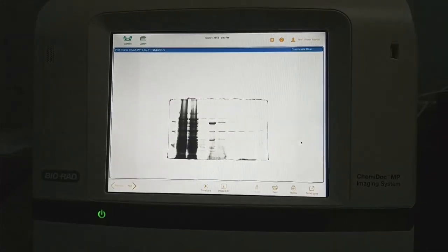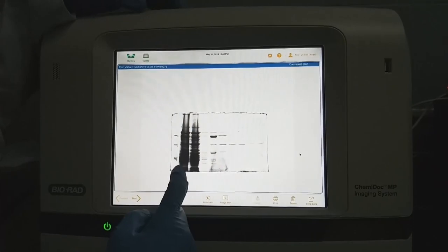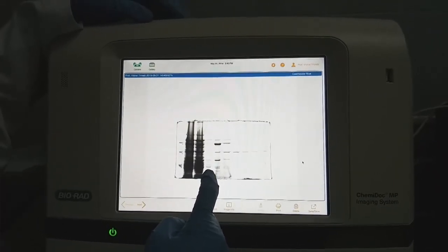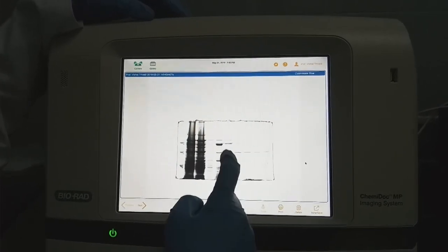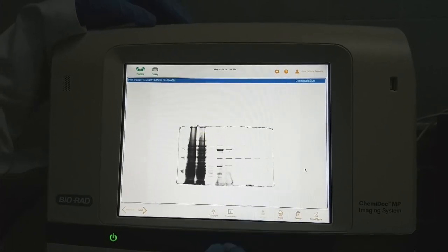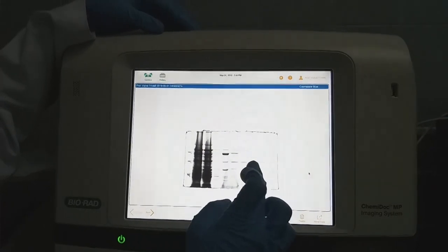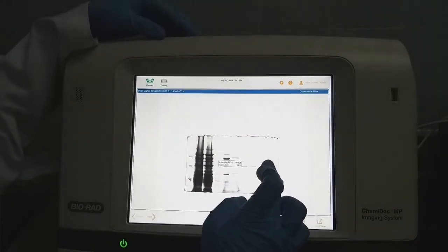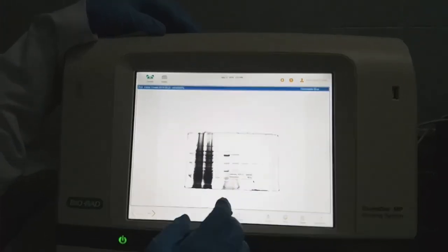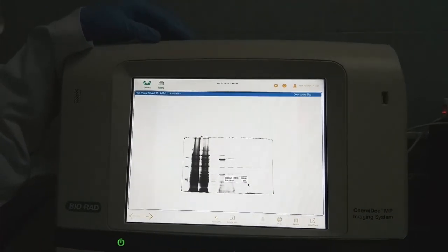So we have loaded a marker from this side. The second one is the load, then flow through, wash 1, wash 2, and these fractions are eluted fractions 1, 2, 3, 4, 5 serially. As we can see, the eluted fraction shows a band corresponding to this protein, but the molecular weight can be calculated using the Image Lab software.